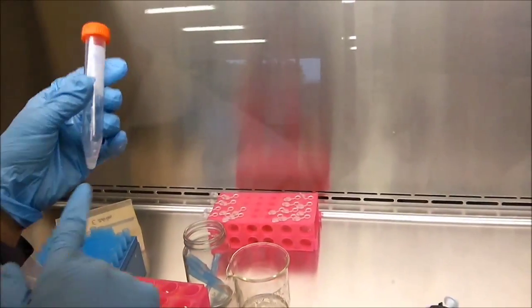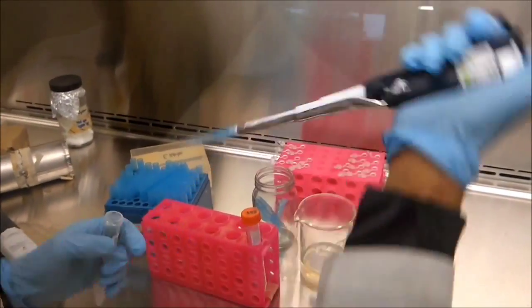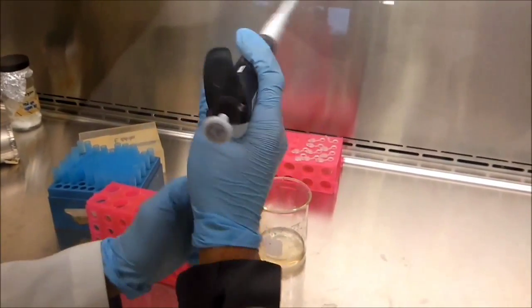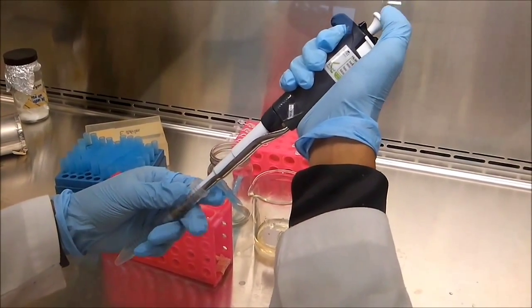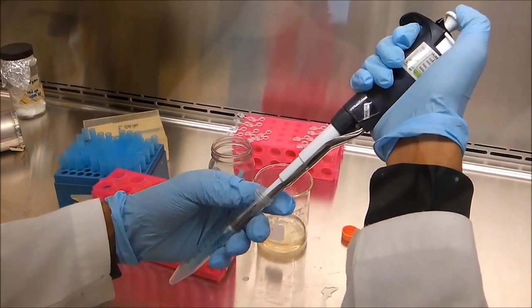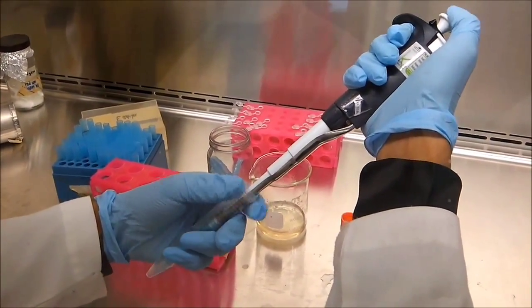For electrocompetent cells, once you get the pellet, you get rid of the supernatant. Then you resuspend the pellet in 10 milliliters of a solution of glycerol at 10% cold. Then you incubate it in ice for 10 minutes and then you centrifuge again. Then you get rid of the supernatant and resuspend the pellet in 2 milliliters of 10% glycerol cold. Then you make aliquots of 200 microliters and you store them at minus 70 degrees.